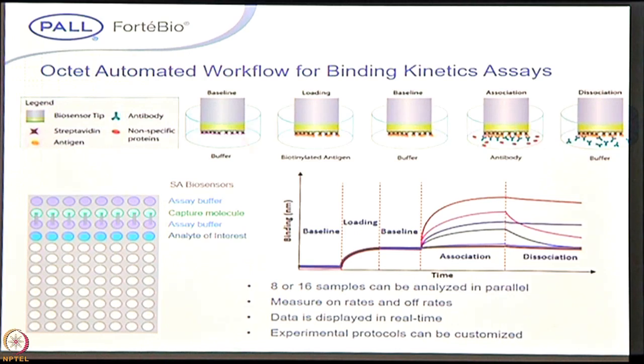I will explain once. The sensor dips into the well containing a first line of buffer, and you get just a baseline. There is no molecule binding, that's why you get a baseline. When the same sensor moves to the next well containing a capture molecule, one of the proteins of interest you have to immobilize on the sensor surface, the sensor dips into that well and you can see the loading response.